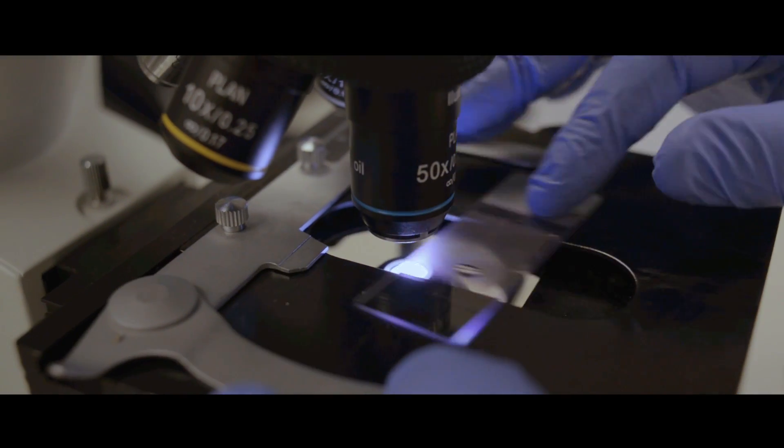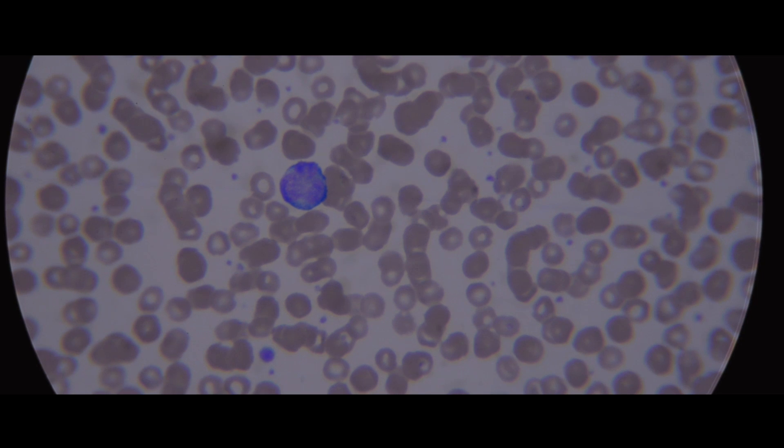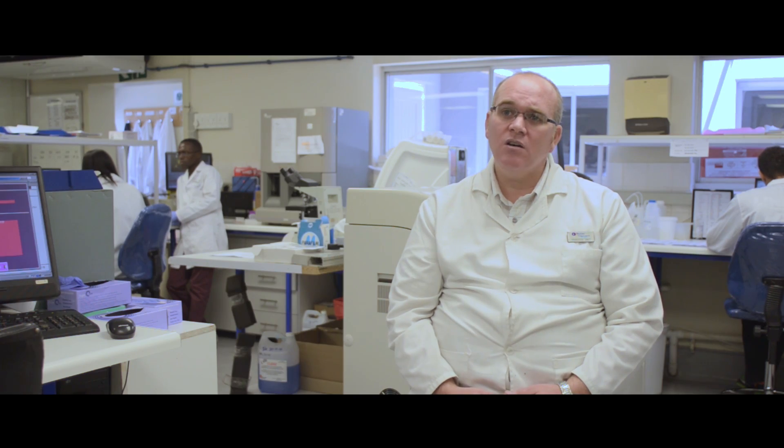After the staining process is complete, we wait for the slide to air dry and we put it under the microscope under oil immersion. We can then have a look and see what kind of abnormalities are on the slide, if there are any abnormal cells.